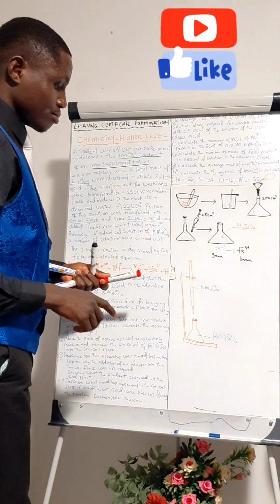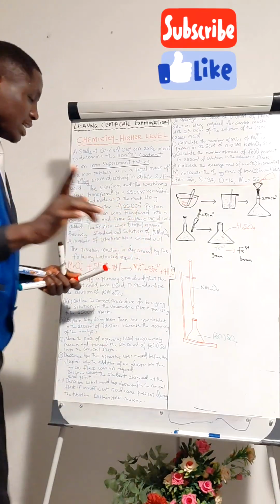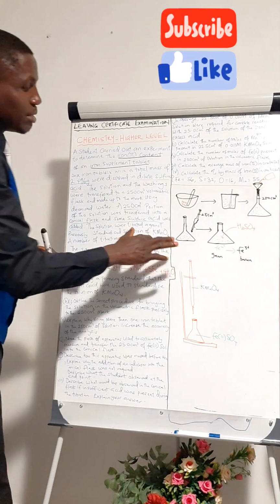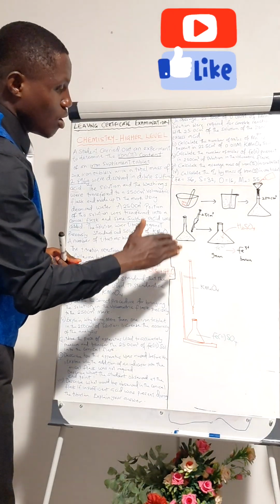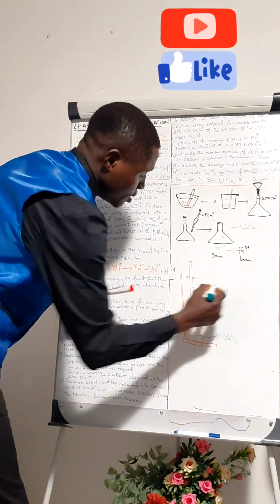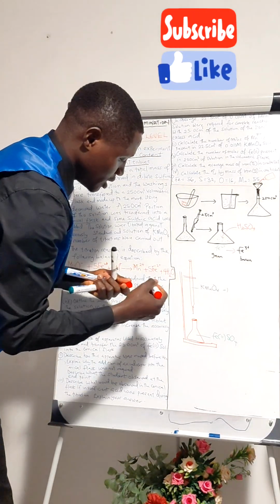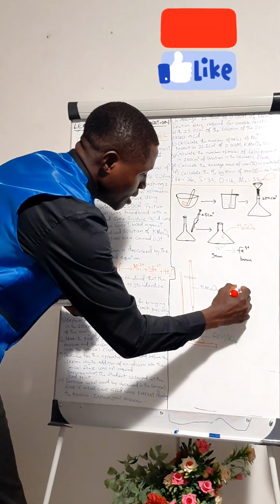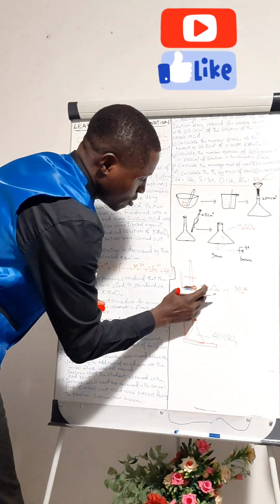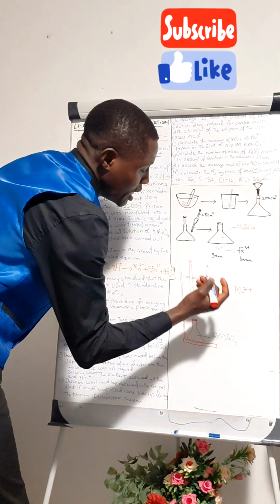So now, what happened here is that this sulfuric acid also prevents the KMnO₄ from going to oxidation number 4. Another thing that this sulfuric acid does is that it prevents Mn7 plus, because the oxidation number of manganese here is +7, from going wrong.